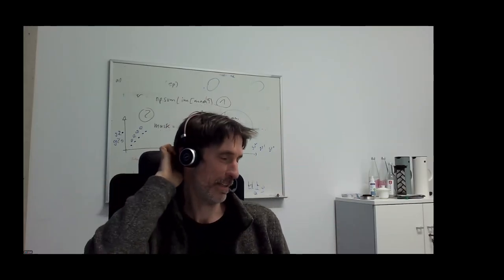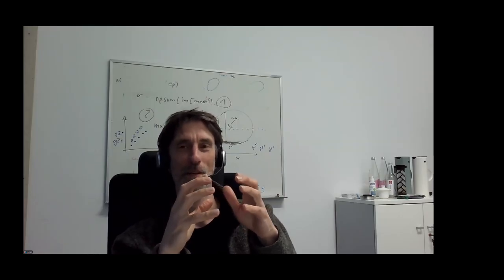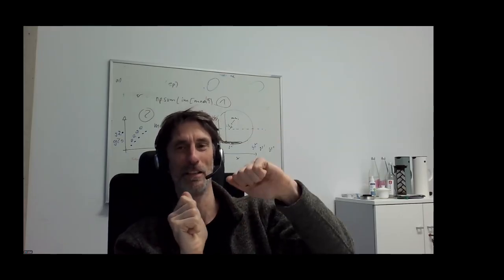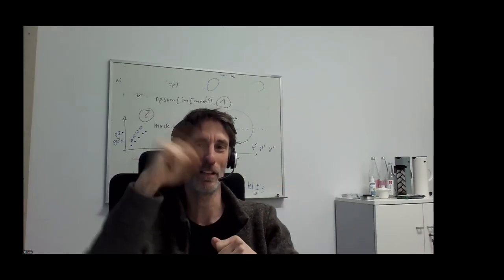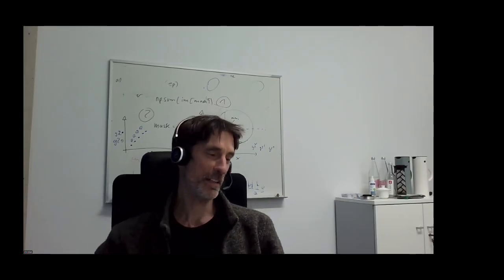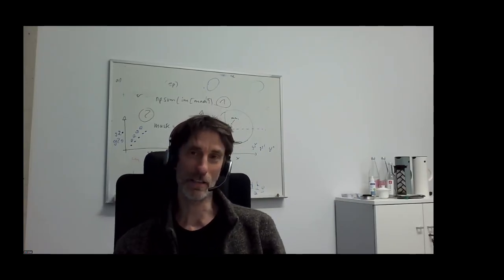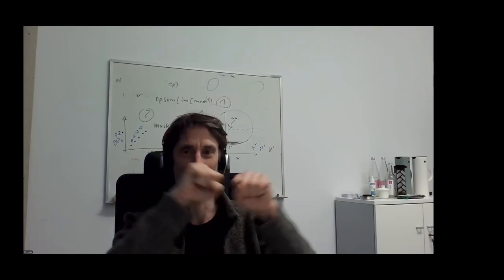That's why the modularity of these processes, the granularity, matters. Maybe you don't want to have a Gaussian blur outside of your segmentation. Maybe just put it together so that you don't have to read and write too much. I think this is a decision you have to make when you design these modules, which is not trivial. You have to think about what is good to be together and what you really want to have separate.